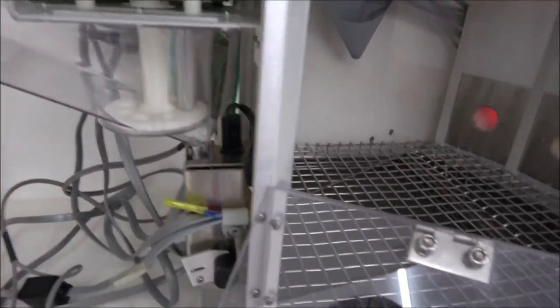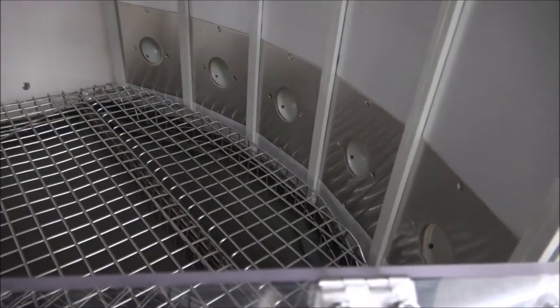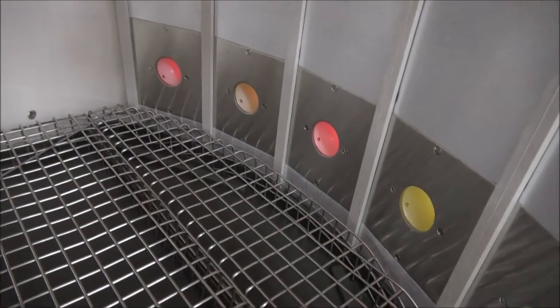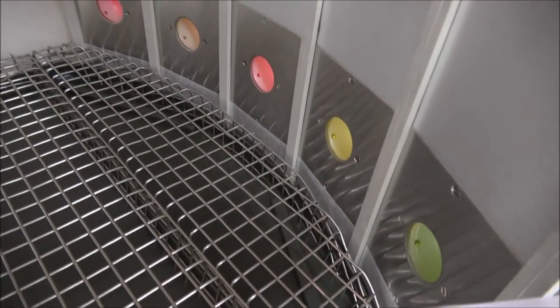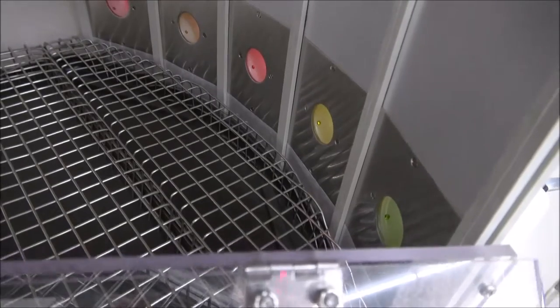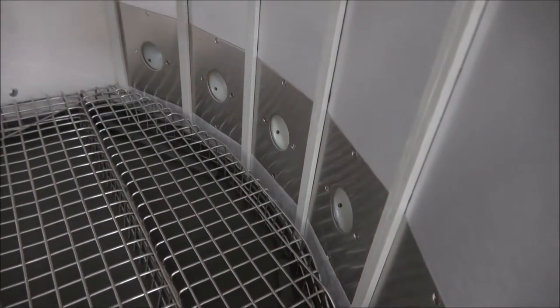Then we come in here to the feeder, and now it's just going to cycle the feeder on and off and follow the feeder all the time and the lighting. But you can see each closet has a different color, so it's stimulating perhaps different rays of light.